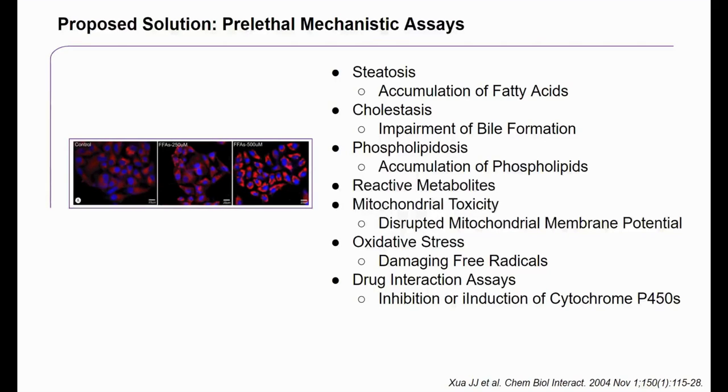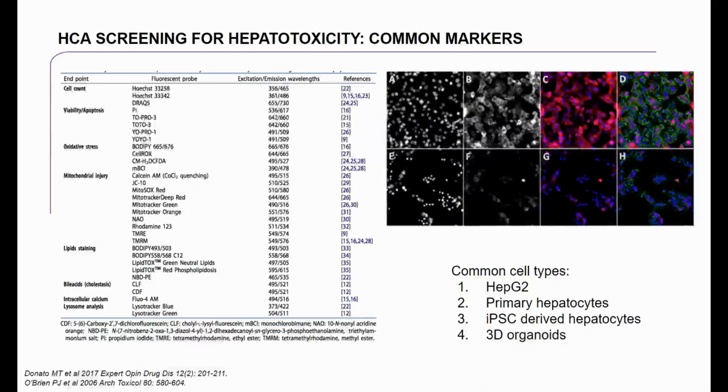And so these were also adopted. Fortunately, for a lot of these types of assays, there were various fluorescent markers out there that could be used with cellular systems. A bunch of them are outlined here in this table. So biologists had some flexibility in how to build these assays.